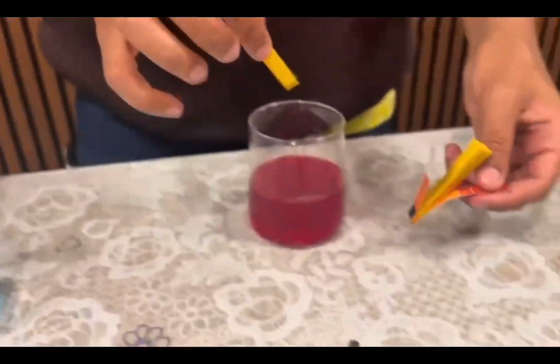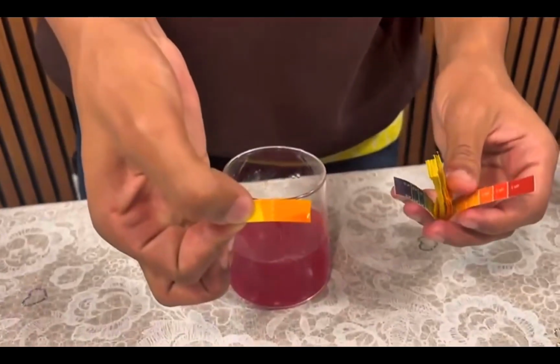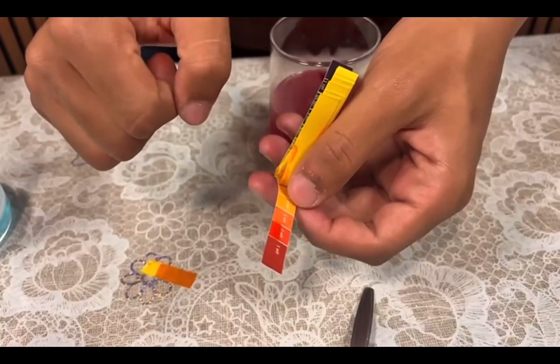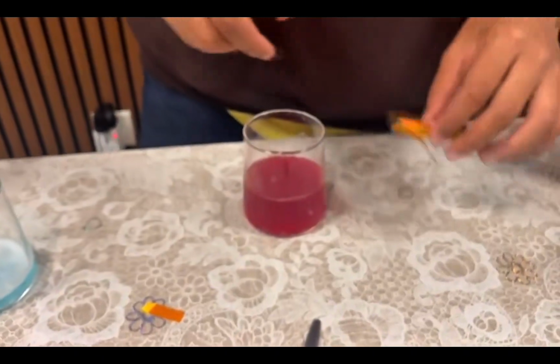That's the acidity scale around the low pH, and yes, it's of course going to be a low pH. Okay, that's around 2 to 3, I think. Yep, as expected, it's around 2 to 3, thanks to citric acid. Let's go.